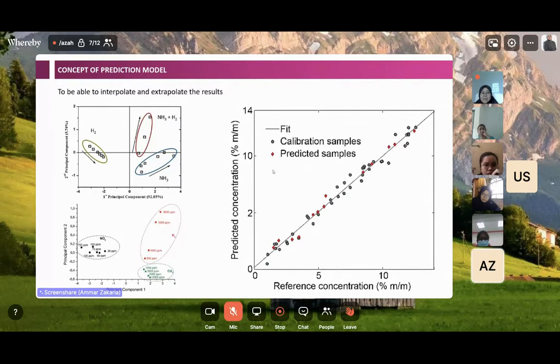For example, you can use PLS, partial least squares. Then you have to do calibration as well. So you have a reference concentration. You need to calibrate the sample. These are the concentrations, and then as you increase the concentration, you get the response increase, right? And then you subject it to the sample, and the sample will tabulate around this area.